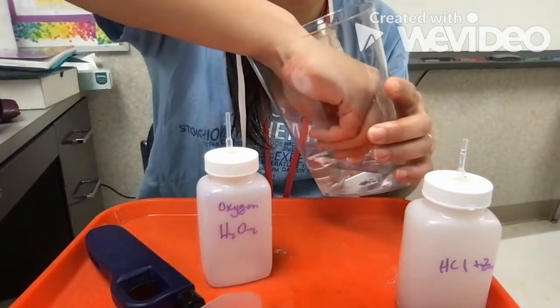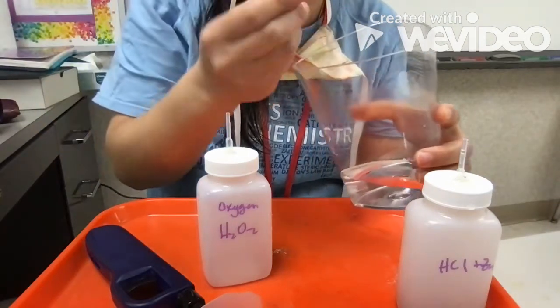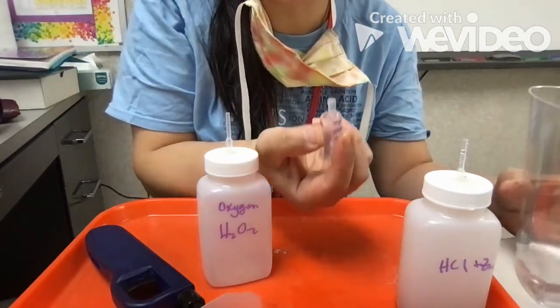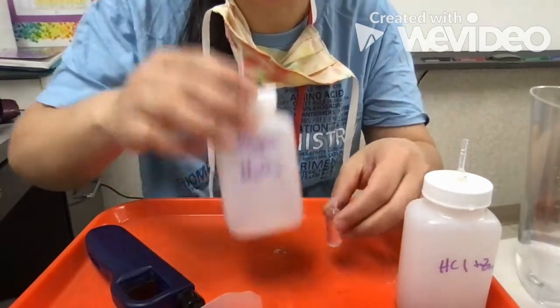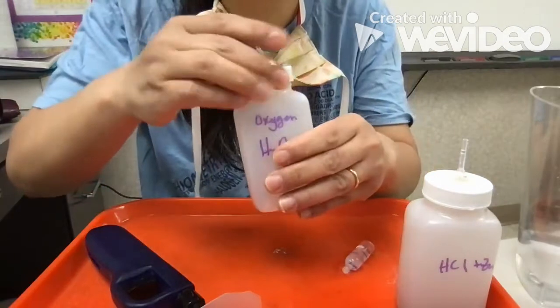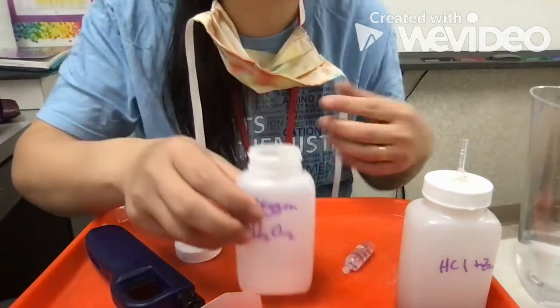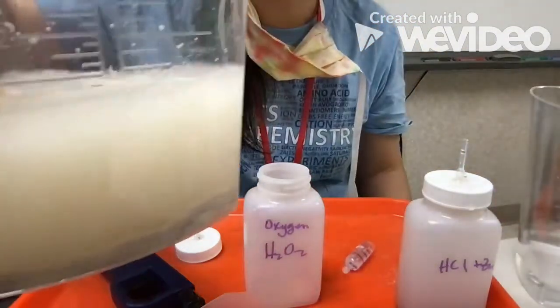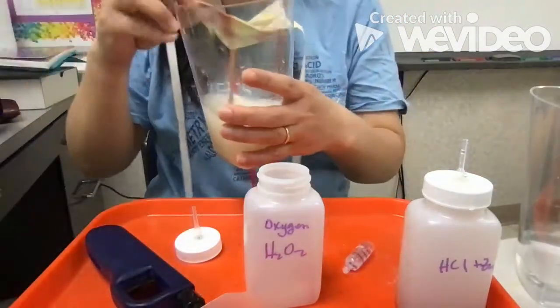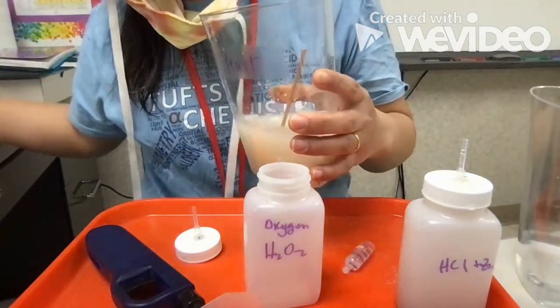Put it in, release, and let it fill up. Okay, now you've got a perfectly full micromole rocket. All right, to make the oxygen, we're going to put in some yeast solution. Okay, so there's our yeast solution. And we get a pipette.